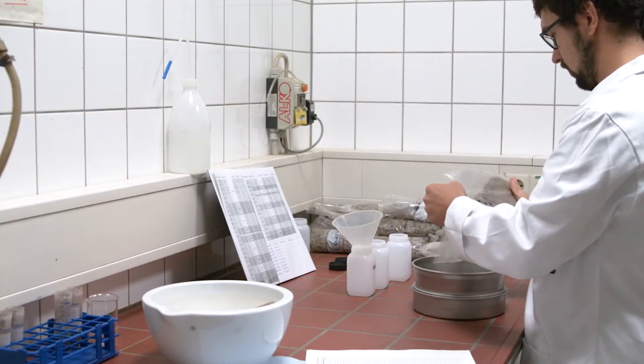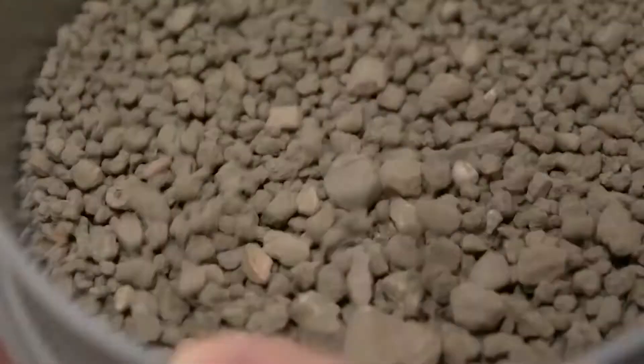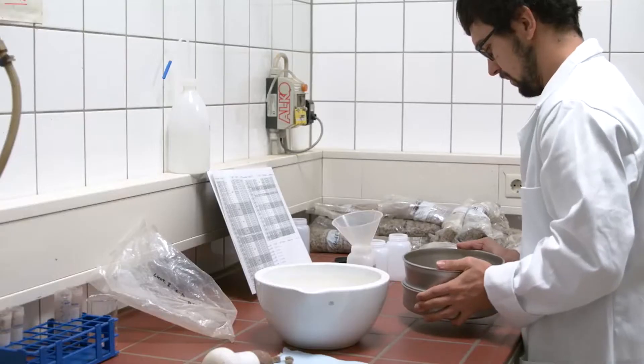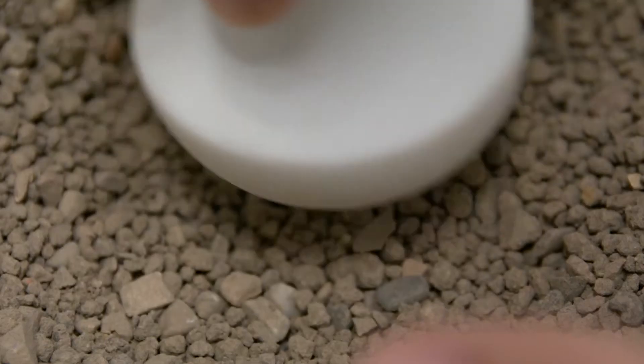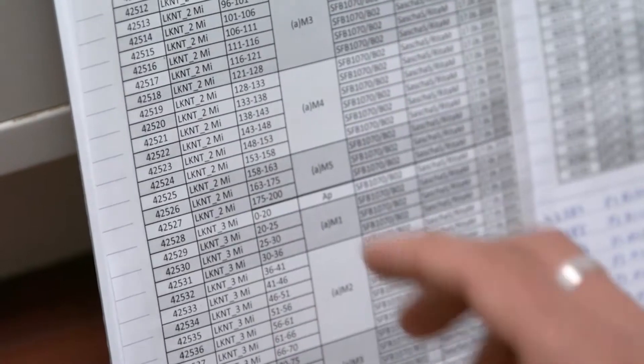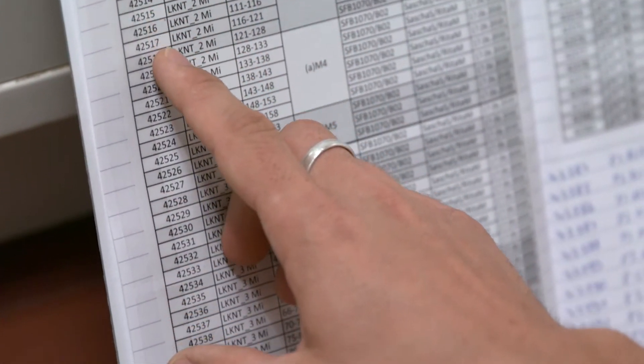Packed in sealed bags, the soil samples are brought from the site to the laboratory. There they are stored and prepared for analysis. Preparation usually involves drying and sifting the material. The samples also get lab numbers to ensure exact identification.